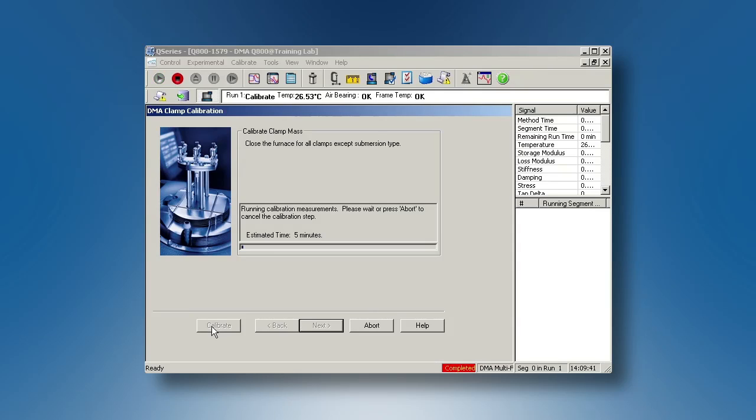This first calibration step is to calibrate the mass of the movable clamp. It is not necessary to close the furnace for mass calibration.